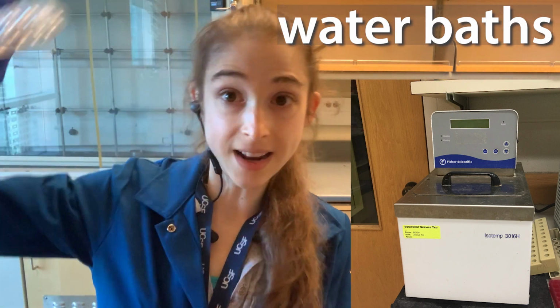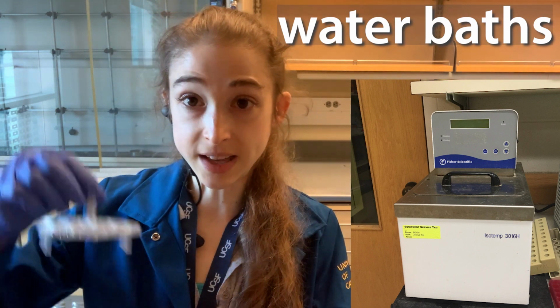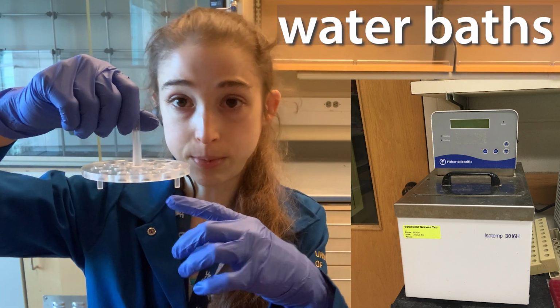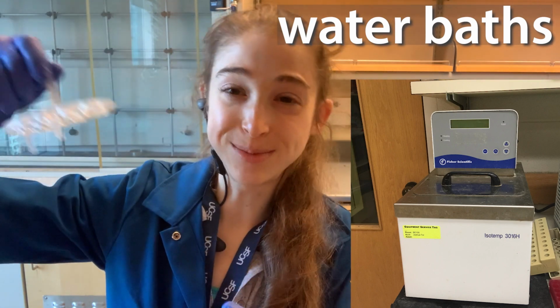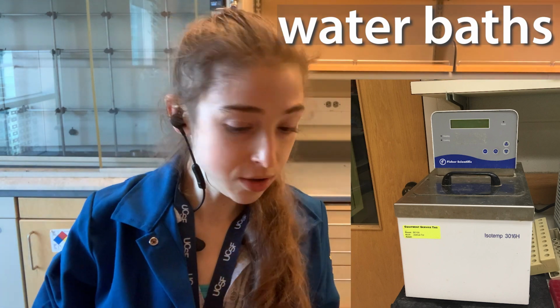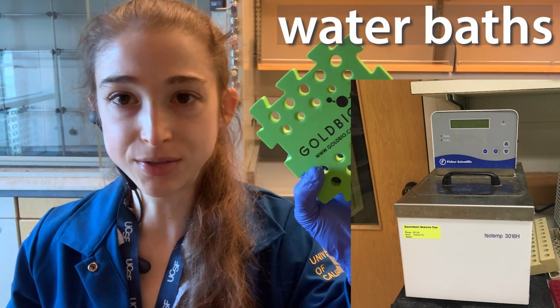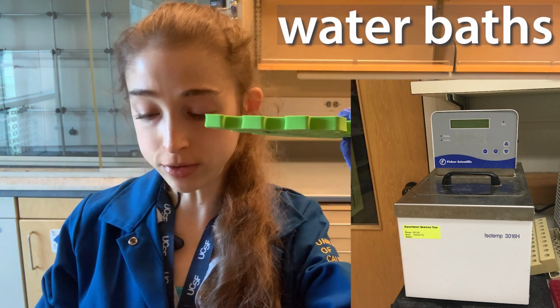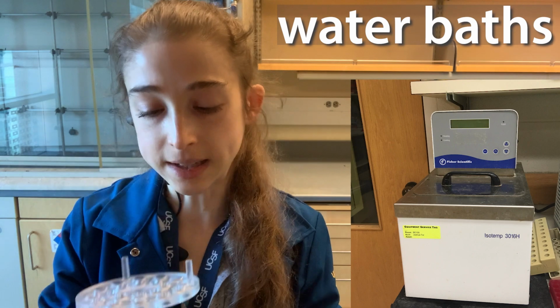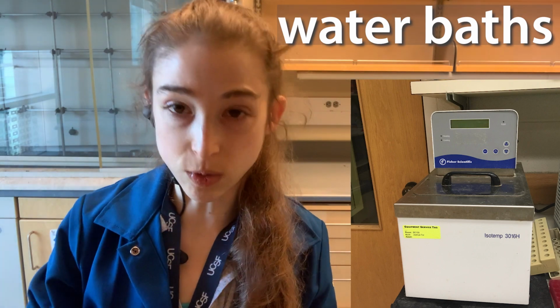It's also really great if you have samples you want to take in and out really quick, and so we often use them for things like doing that heat shock step, where we need to take samples, put them into the warm environment for 42 seconds, or 45 seconds, and take them out really quick. And so we can use one of these flotation devices. I'm not trying to advertise for Gold Bio or whatever, but you'll often see these as swag by bio companies. You can put tubes in them and they'll float, or you can get some sort of plastic thing like this. And basically what this does is now you can stick all your tubes in and take them in and out as one, which is nice.